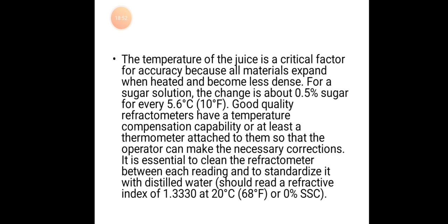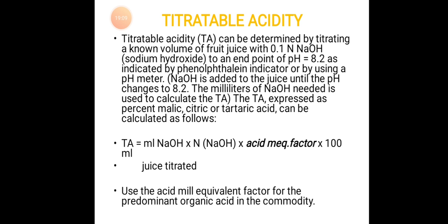It is essential to clean the refractometer between each reading and to standardize it with distilled water. It should read a refractive index of 1.3330 at 20 degrees Celsius, 68 degrees Fahrenheit, or 0% SSC.